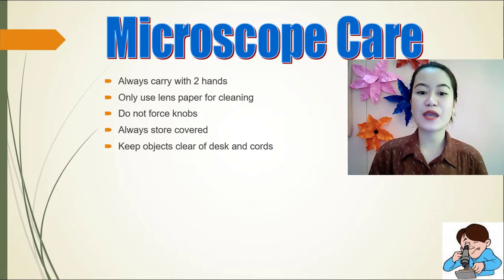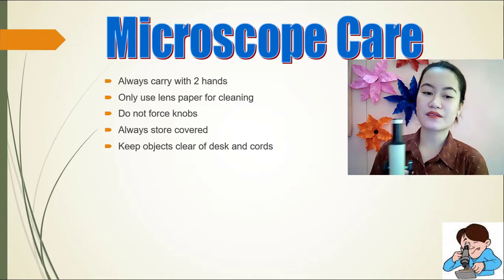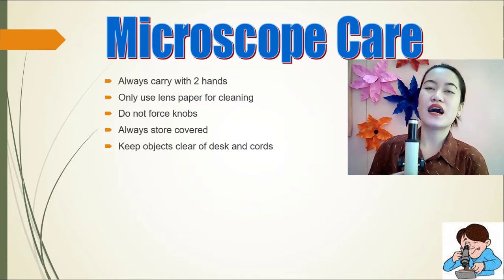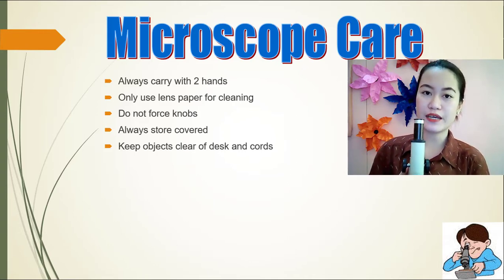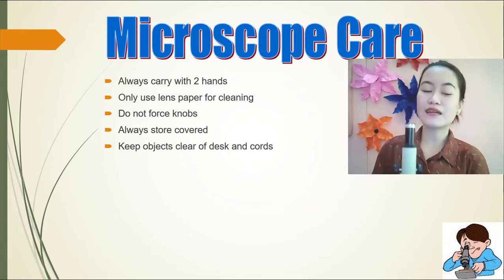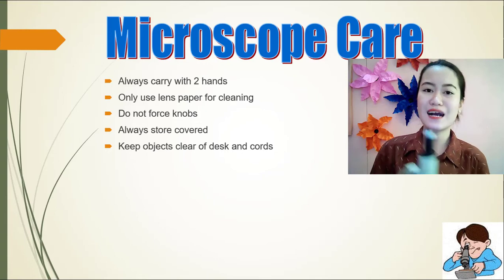Only use lens paper for cleaning. So kapag po tayo ay maglilinis ng microscope, gumamit tayo ng lens paper for cleaning. Example, yung mga tissue, or yung cotton. So, kailangan malambot lang. And the next, do not force knobs.